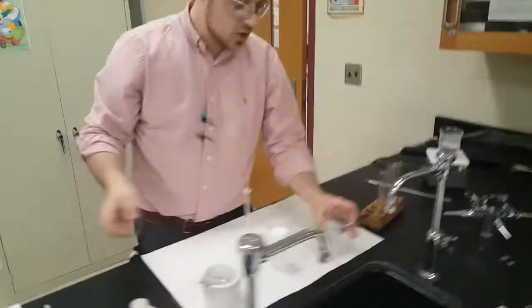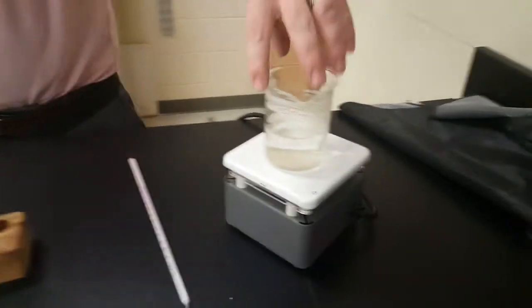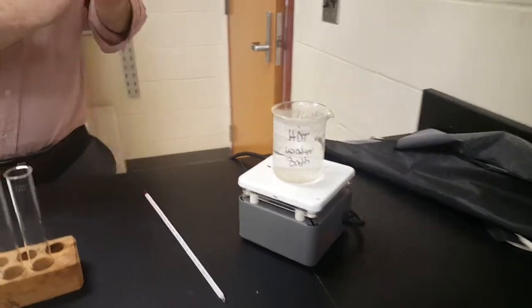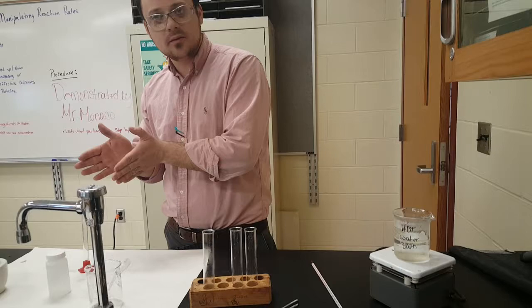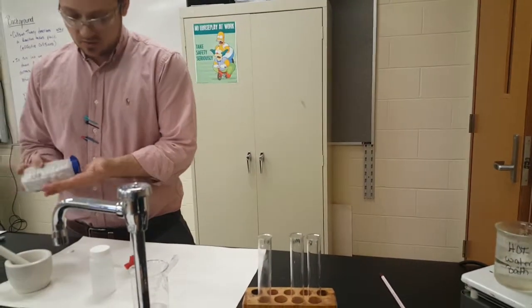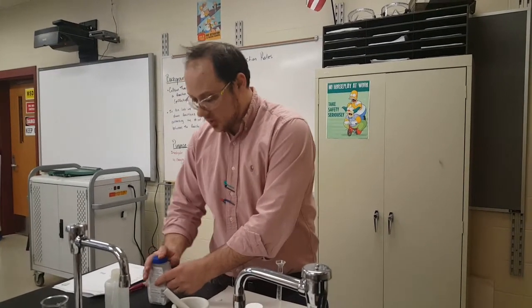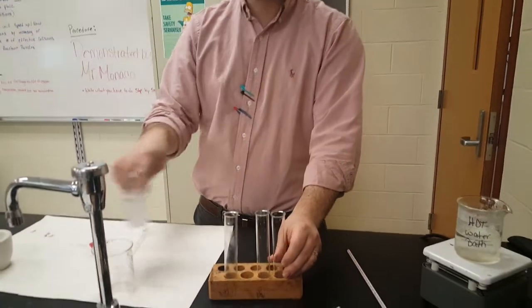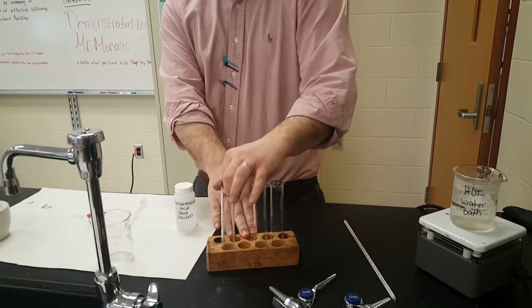You're going to change the temperature of the reactants. We got a hot water bath going here. If it's not boiling, that's okay. We just need to be able to compare room temperature to middle of the road to hot. So what are we going to do here? We are going to, again, use 3 tablets, but the 3 temperatures that we're going to do are room temperature concentrated acid, medium temperature concentrated acid, and hot concentrated acid.